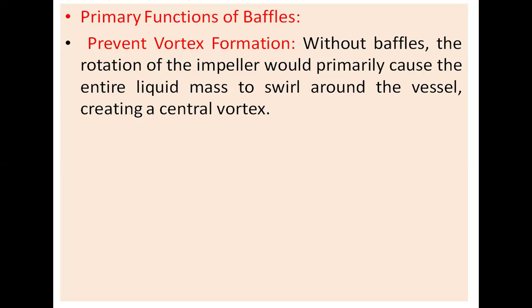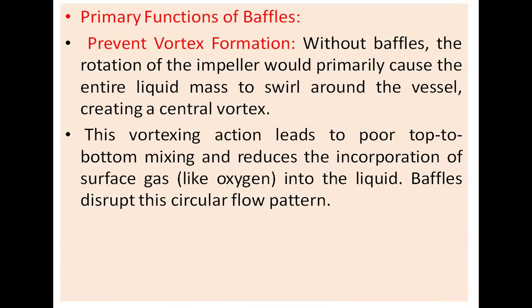What happens then, the microorganisms are not able to grow properly, and uniform distribution of the nutrient, heat and the pH and the aeration is not possible. Mixing is also not possible. So to prevent the vortex formation, to prevent the swirling, there will be the presence of the baffles.